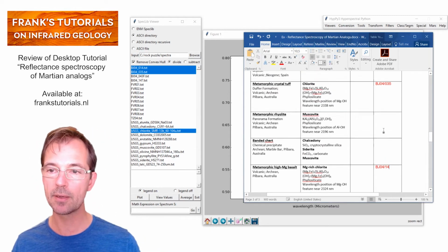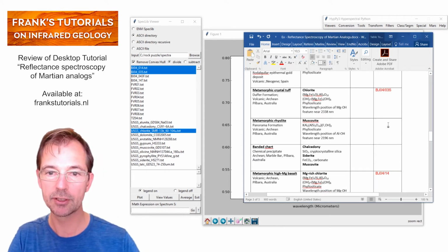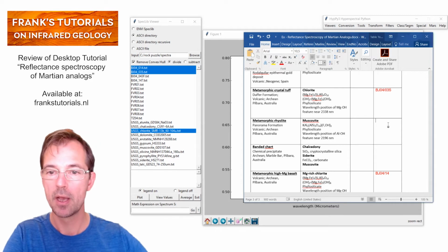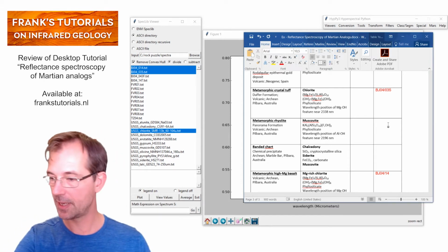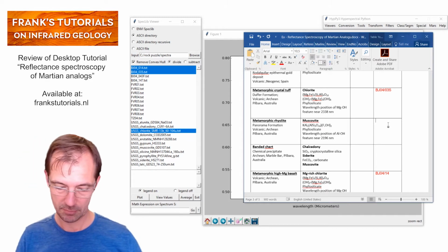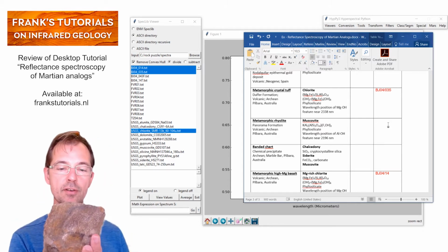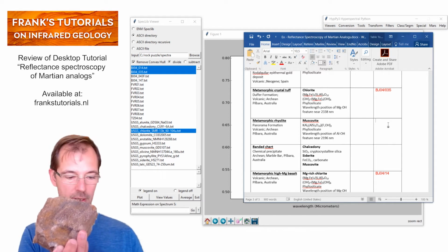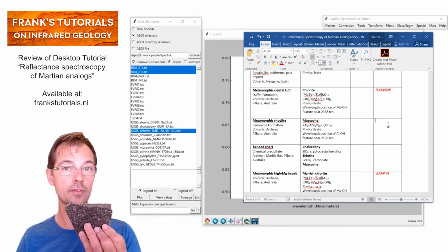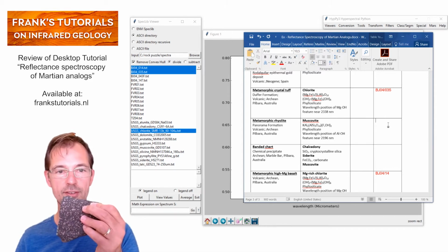Good. And then we continue to the next one, which is a metamorphic rhyolite. Yeah, so this is also a volcanic rock. It's also metamorphosed, but not foliated. Well, we do have a few candidates. So we have two metamorphic volcanic rocks left. And that's this one, the BJ04147, and the BJ04043. And here you can see very nicely the volcanic texture with the phenocrysts.